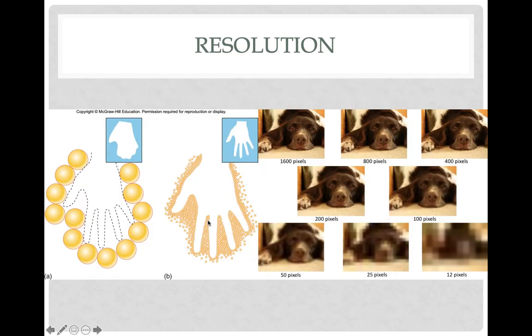Some microscopes use light, compound microscopes do. Other types of microscopes use electrons or different rays of light with smaller and bigger wavelengths and things like that. So resolution from a microscope refers to its ability to resolve one little tiny cellular structure from another, or one cell from another, underneath the microscope. So how this works: light beams are quite large. They're very wide. If you've ever seen the little zigzaggy waves of the light spectrum, you'll know light beams are quite large.